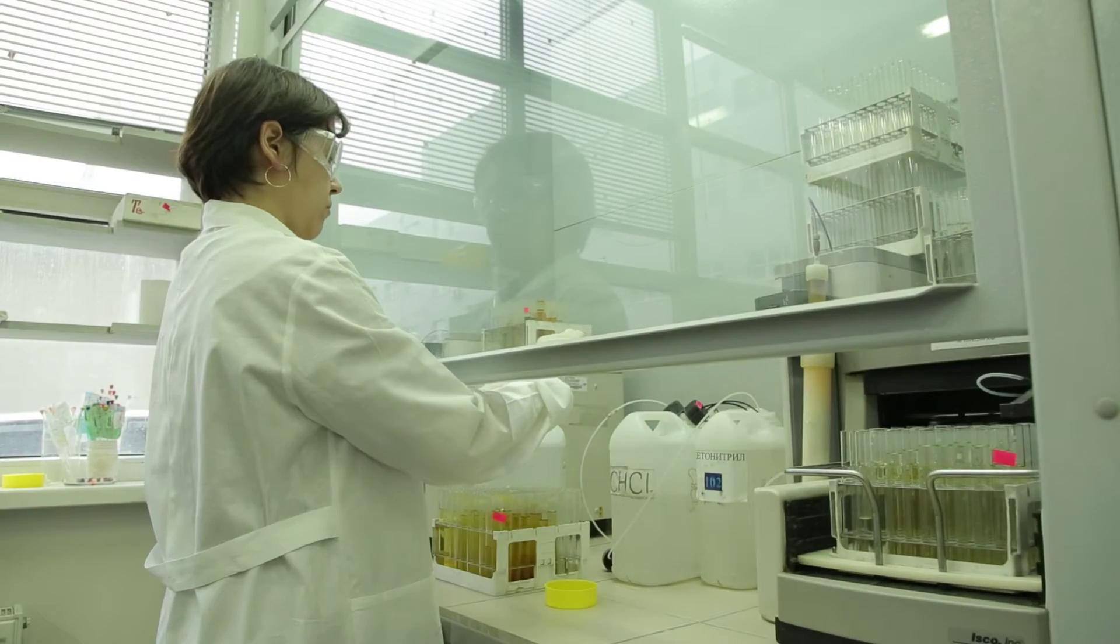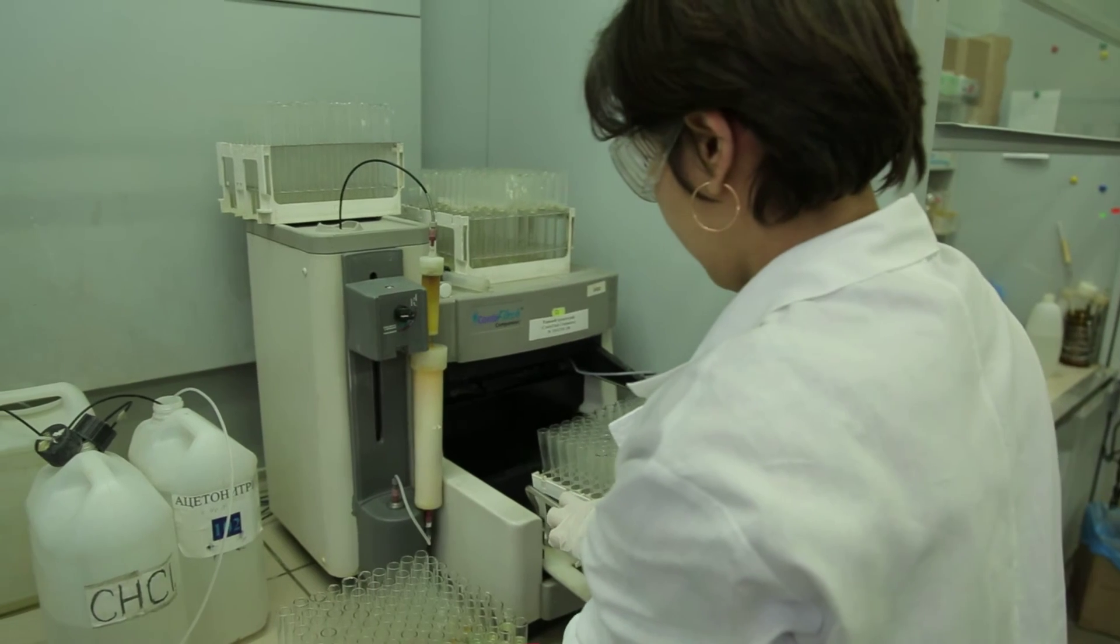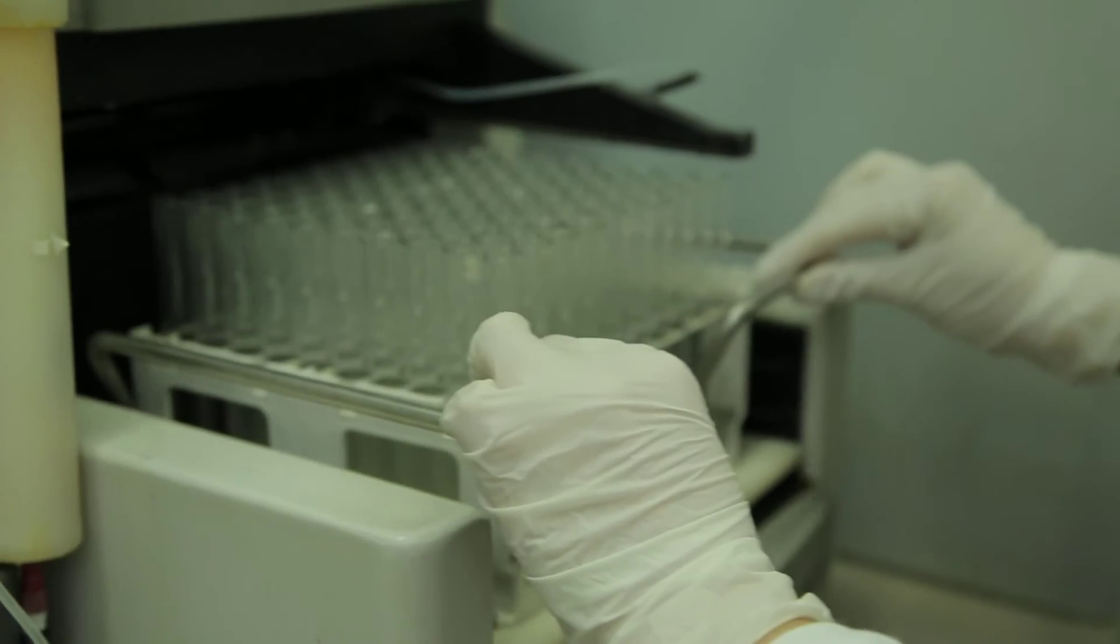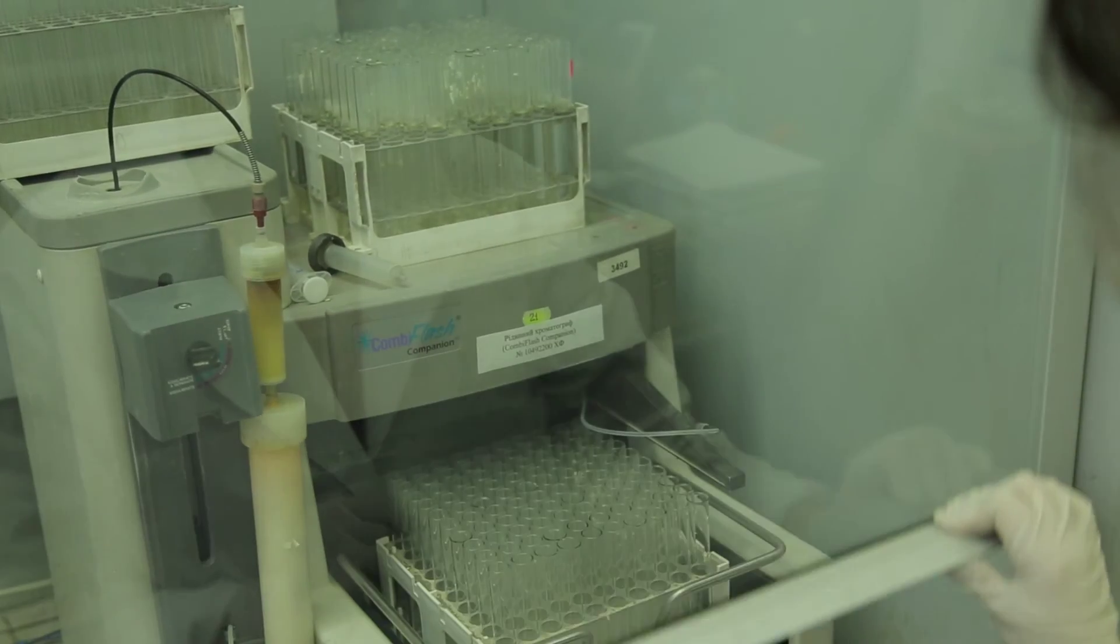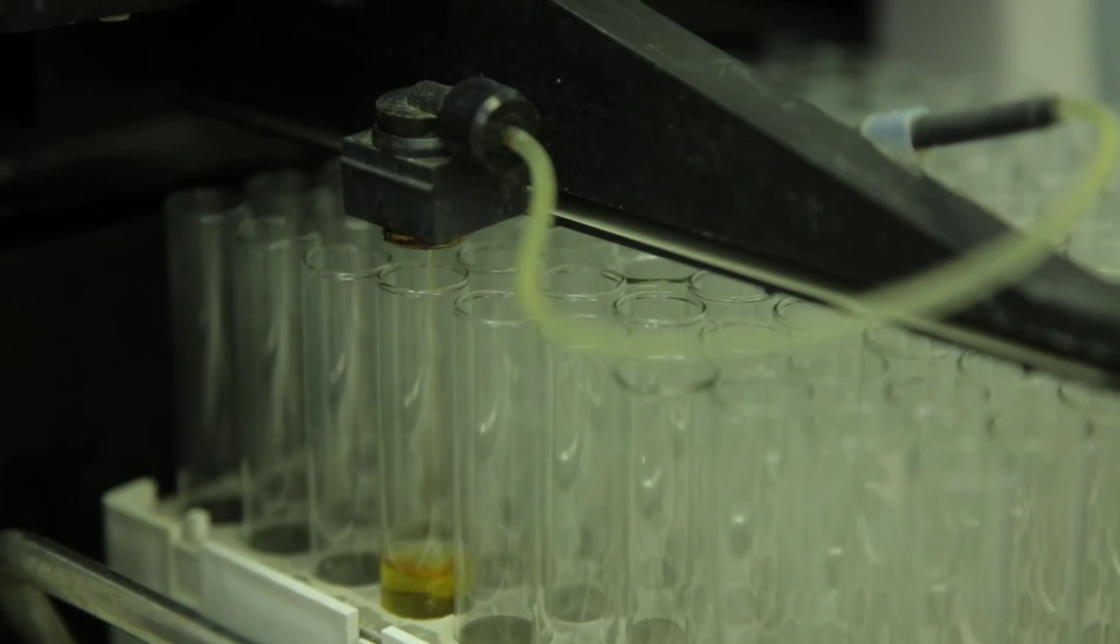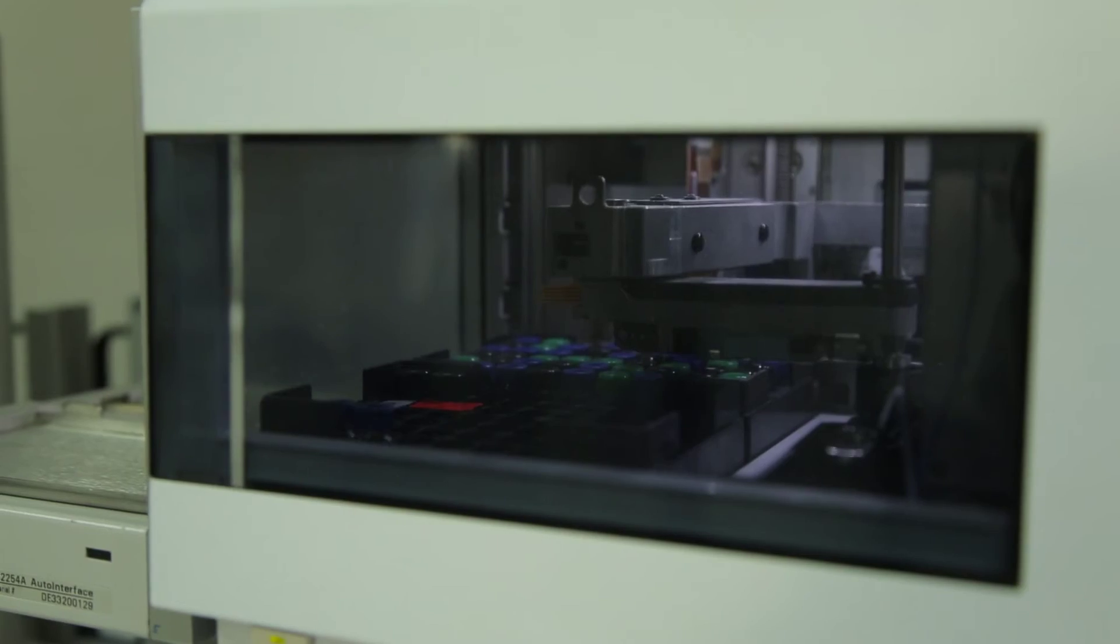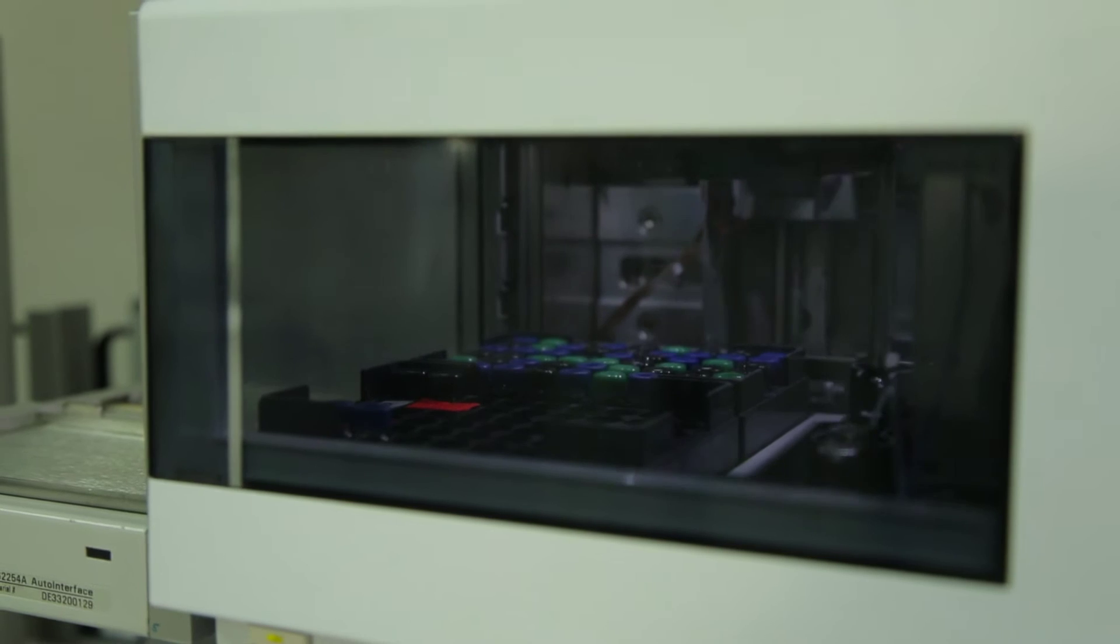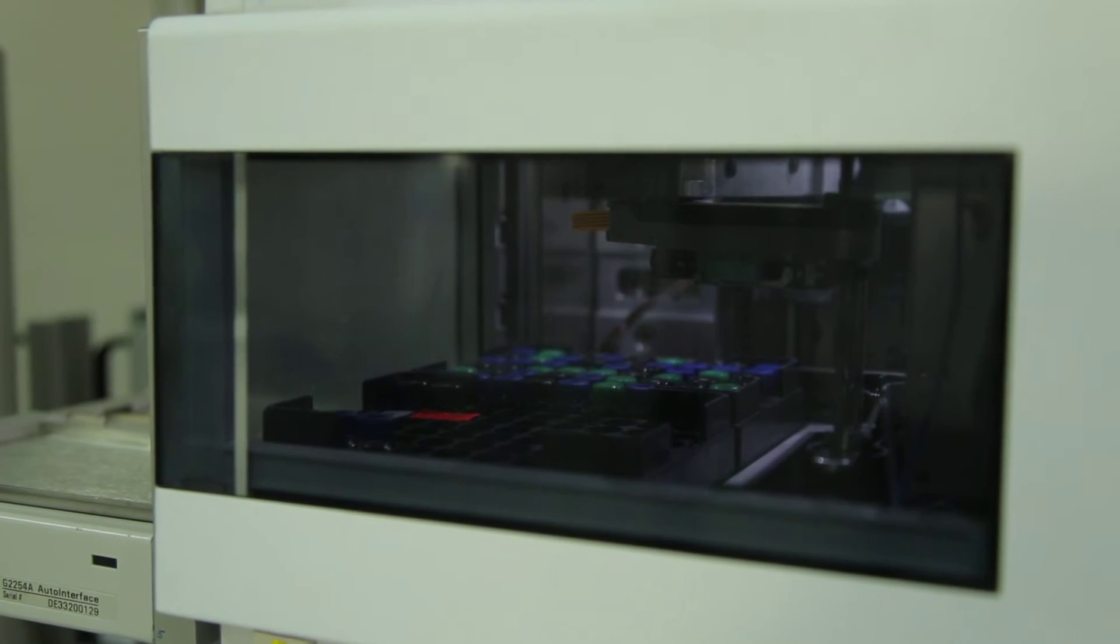Our preparative chromatography unit uses various techniques to meet the needs of our chemists. It has 29 low-pressure CombiFlash systems with loading capacity of 100 mg to 20 g, three Buchi systems with operating pressure up to 50 bars and loading capacity ranging from 20 to 500 g. For smaller samples, we have four Agilent HPLC-MS instruments with loading capacity of 50 to 150 mg, equipped with reverse-phase columns.